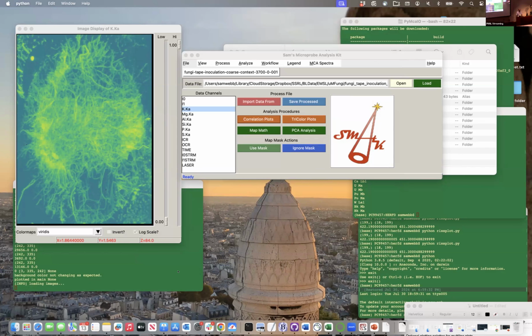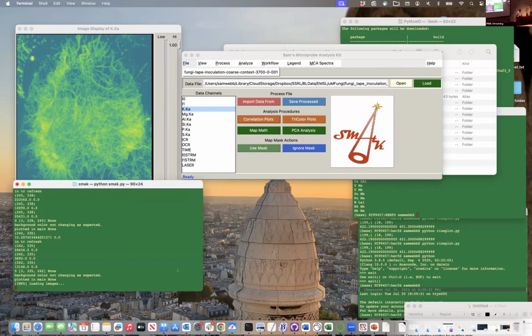It's thinking about it. It's ironic that the optical images are actually larger than our data sets normally now, because we're taking nice 5 to 8 megapixel tiles, and our data is maybe only 1,000 by 1,000 pixels. It will stitch it for us. Oh, actually, it even worked.